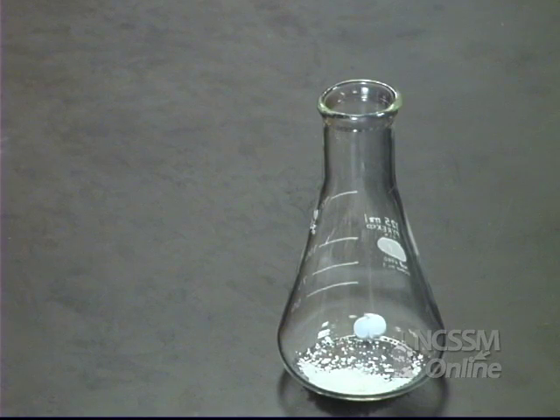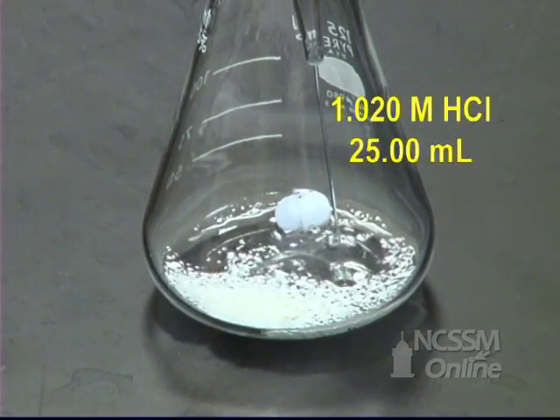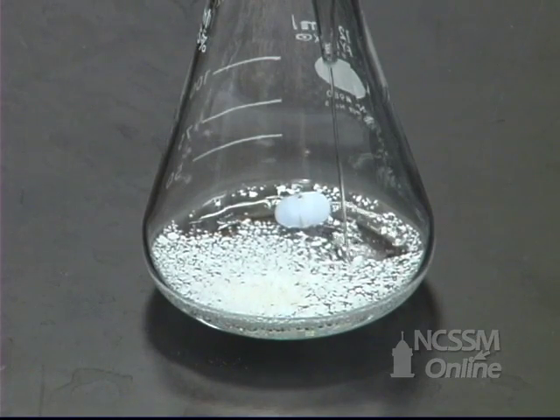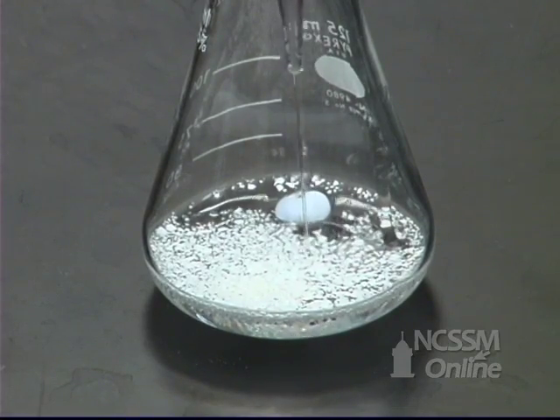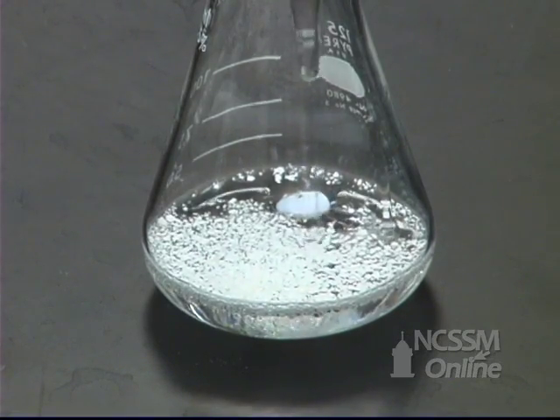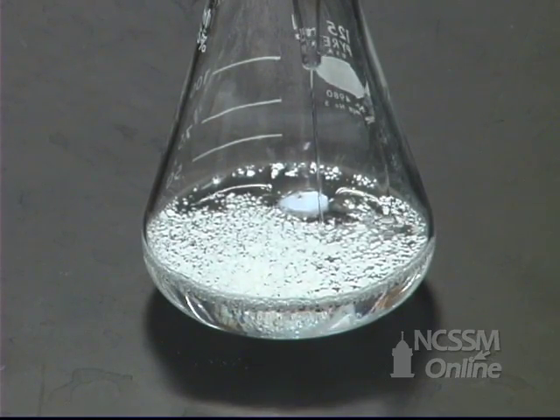We're going to pipette 25 milliliters of a standard solution of approximately 1 molar hydrochloric acid to the eggshells. The calcium carbonate in the eggshells will react with the hydrochloric acid to produce water, carbon dioxide, and calcium chloride. There will be an excess of hydrochloric acid at the end of the reaction.